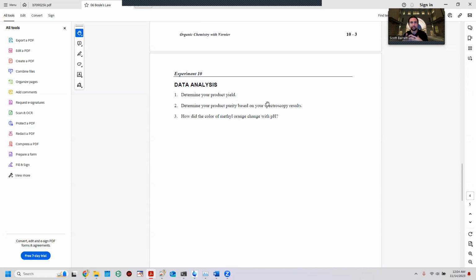And that's because, let's just say you put 100 milligrams of azobenzene into a given vessel and you were going to measure it using spectroscopy. So you measure it with spectroscopy, and then you found out, okay, I actually have only 95 milligrams of that 100 that are pure, found relative to concentration and absorbance. And so with that result, you know that since you have 95 milligrams of pure azobenzene and 100 milligrams of azobenzene total, you have 95% purity.